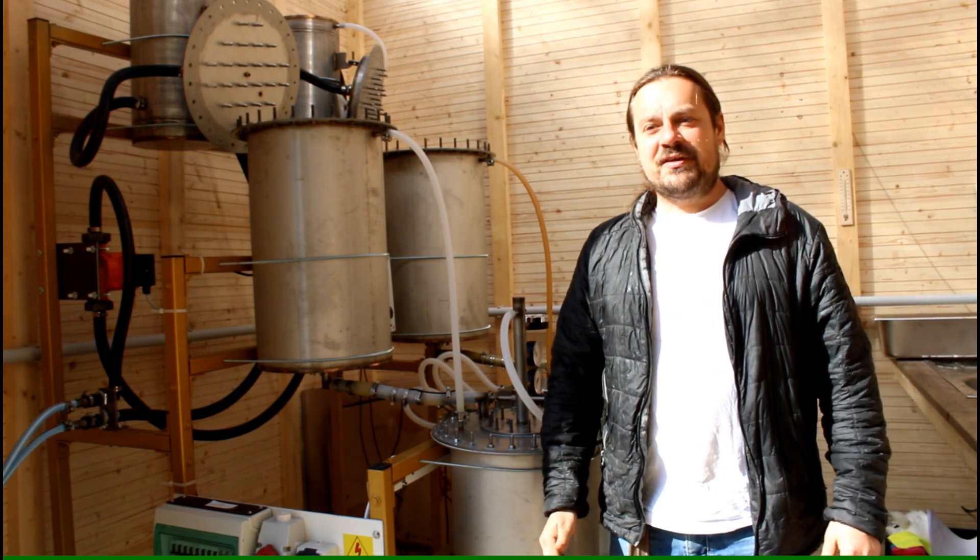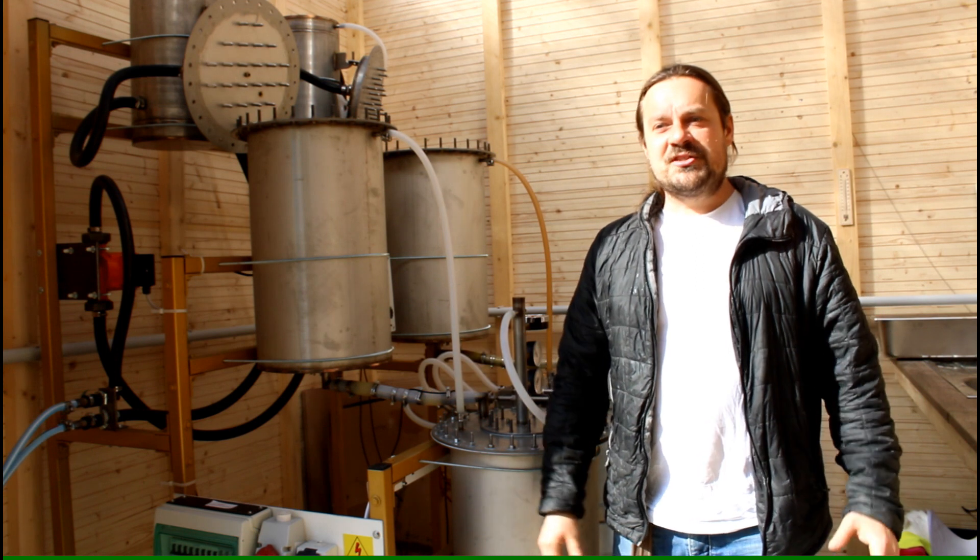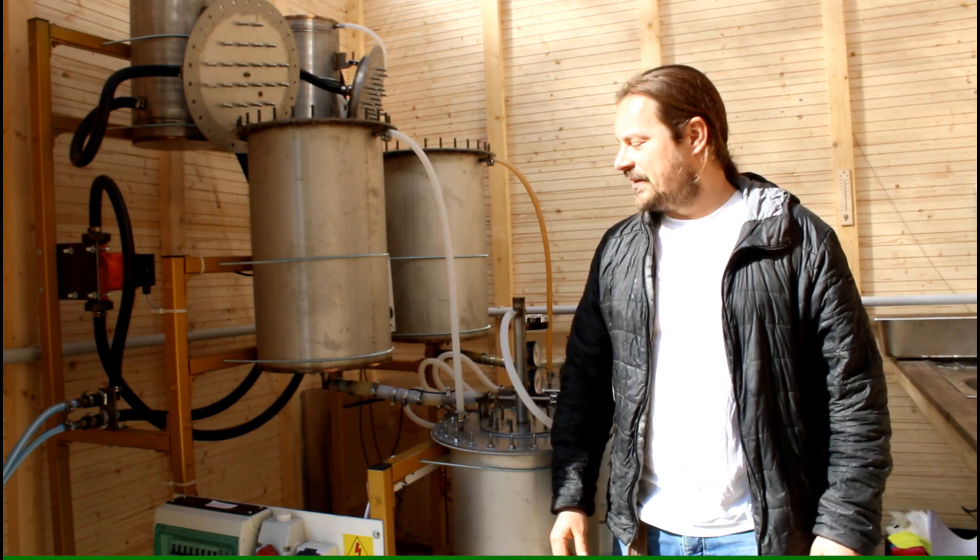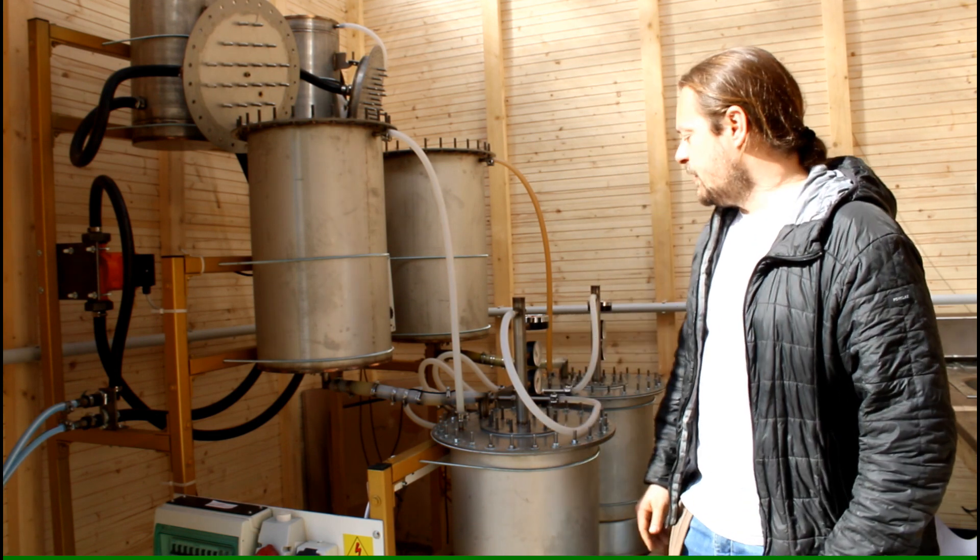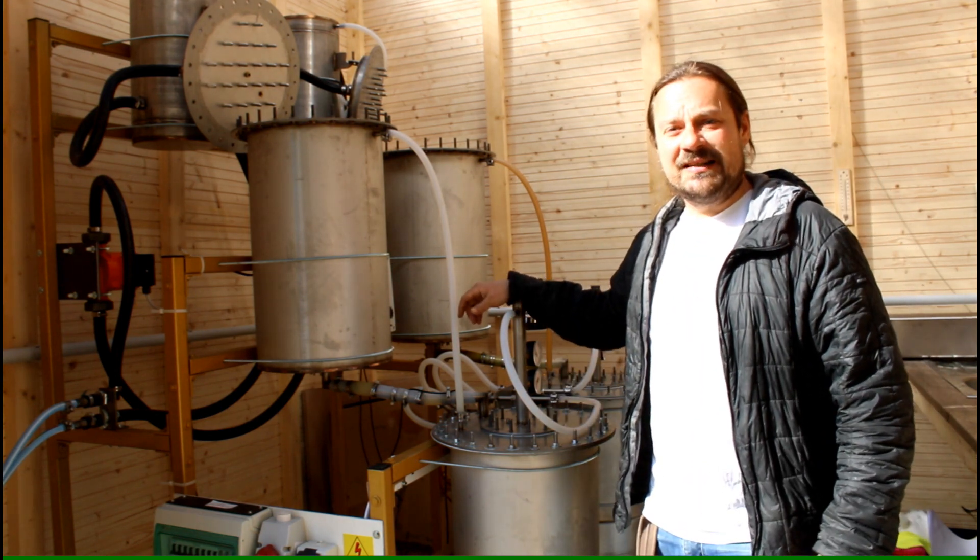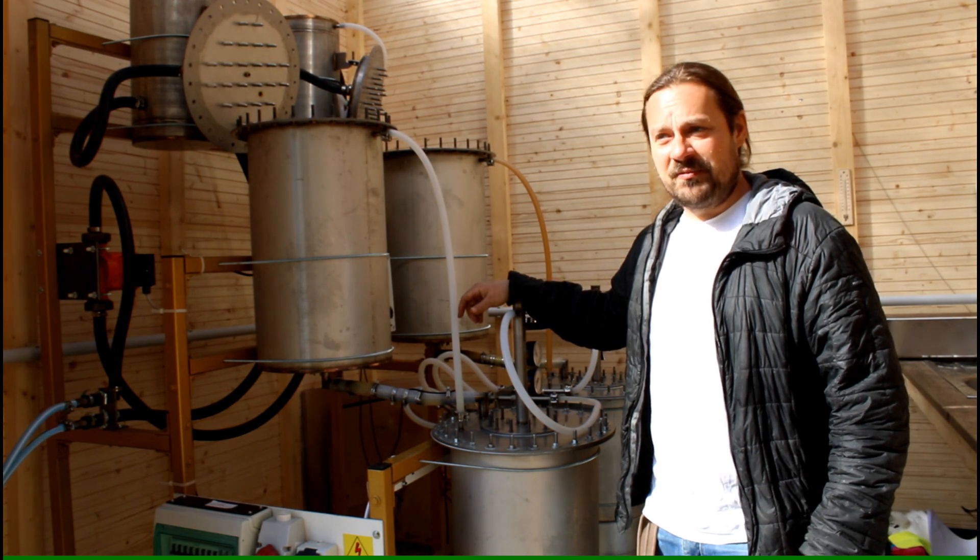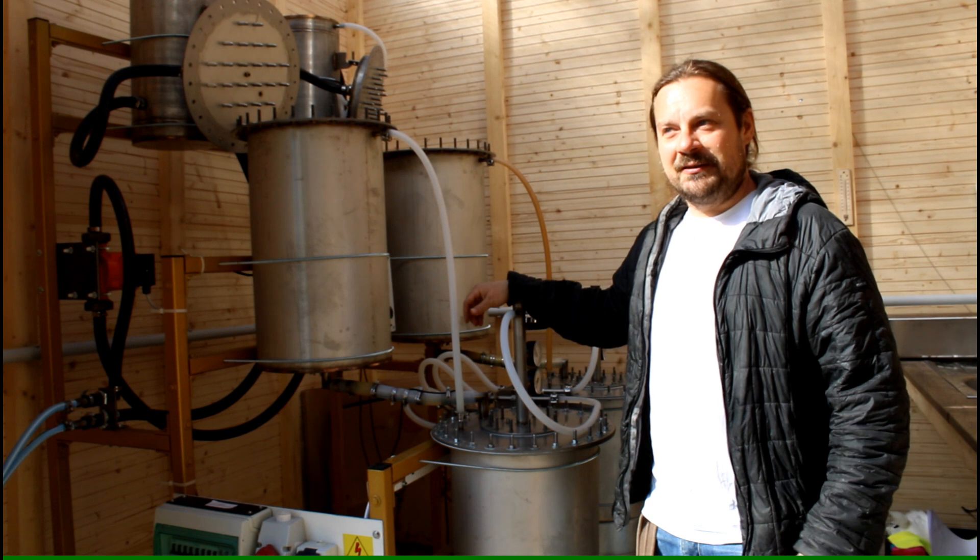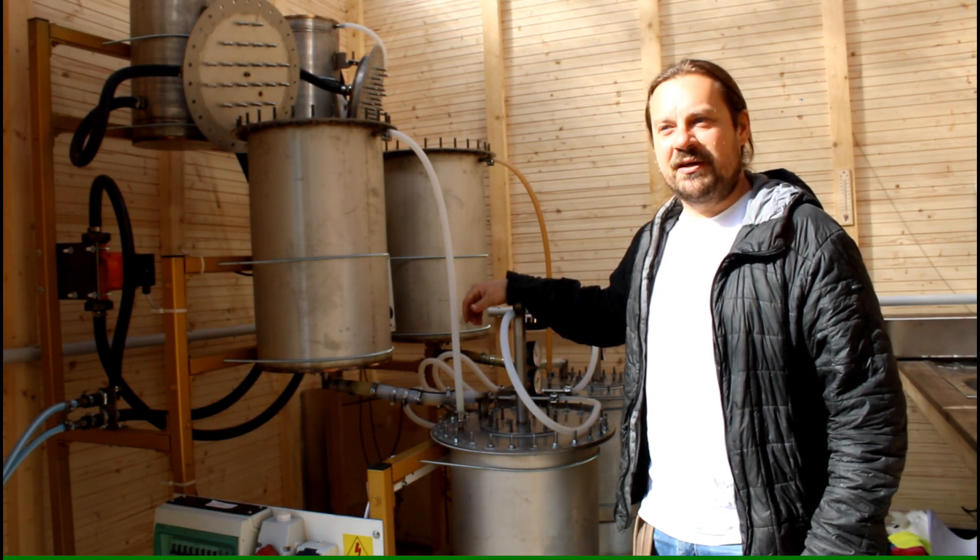You might ask yourself the question why it is standing outside in a self-made shed like this. It's very simple because this contains up to 100 liters of solvent and ethanol, if it is in the gaseous form, can be very explosive.